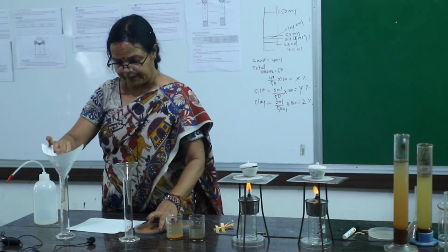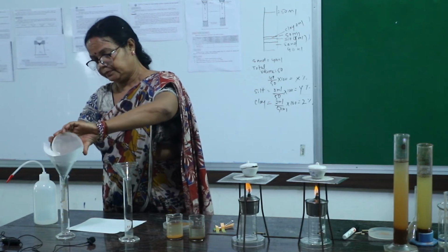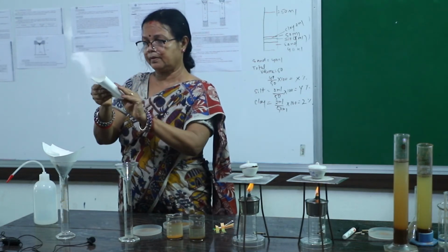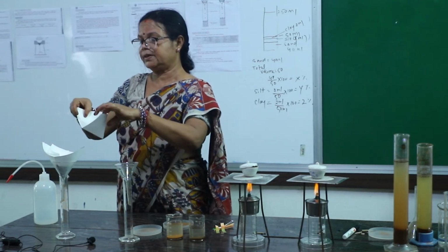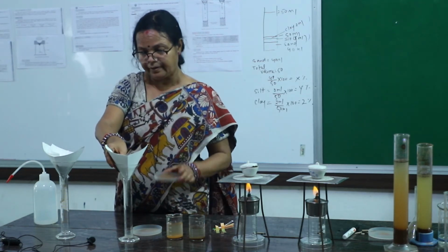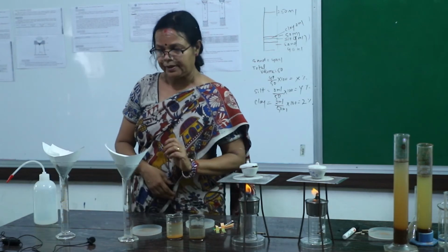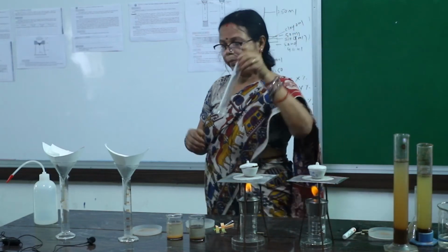Okay, let's take roadside soil. Then take another filter paper. First fold, second fold, one side 3 layers, other side 1 layer. Also fix it here, then put garden soil here. Okay. Then take another measuring cylinder and take 50 milliliter of water.